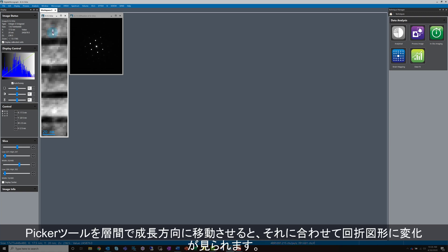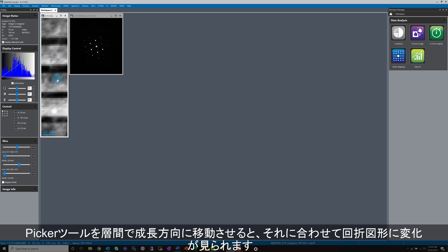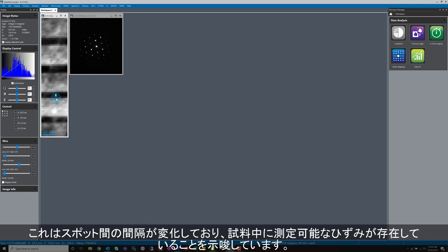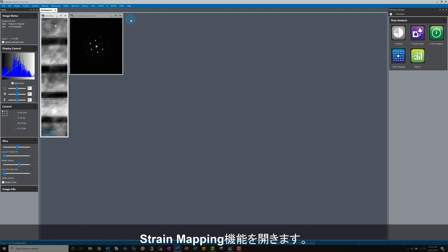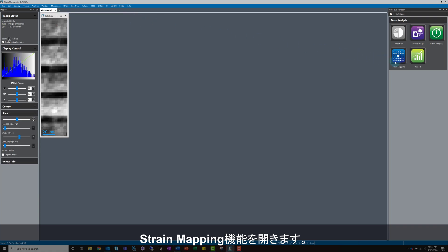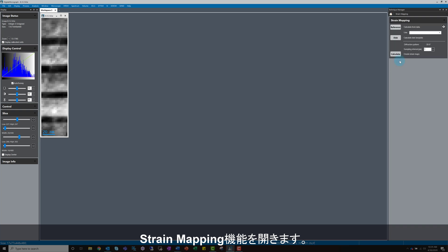As I move the Picker tool down along the growth direction and through the layers, you can see that the diffraction pattern appears to breathe, which is a good indication that the distance between the spots is changing, so we expect there to be some measurable strain in this sample. Start by opening the strain mapping technique. As with other techniques, we just need to follow the workflow and go from top to bottom.